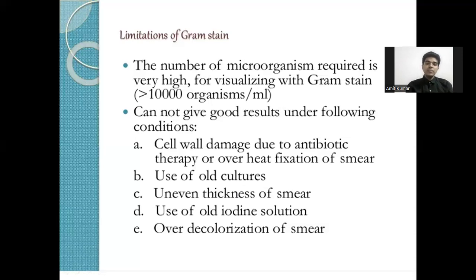Then if the iodine is too old, the efficacy of the iodine is not working properly, and it does not combine properly with crystal violet, which results in no formation of the CVI complex. If you over-decolorize the smear, then gram positive bacteria become gram negative bacteria.